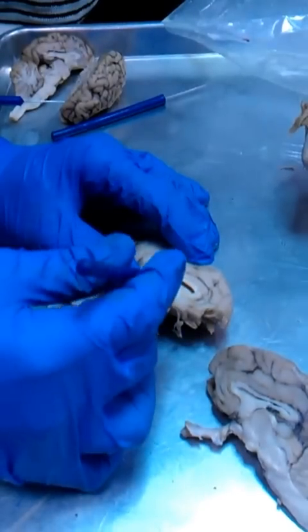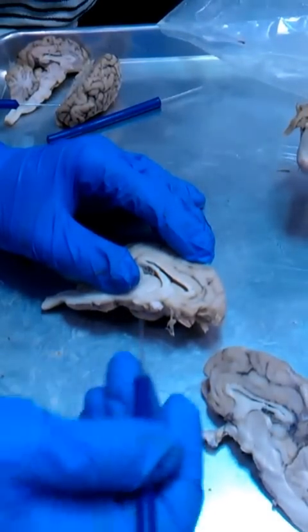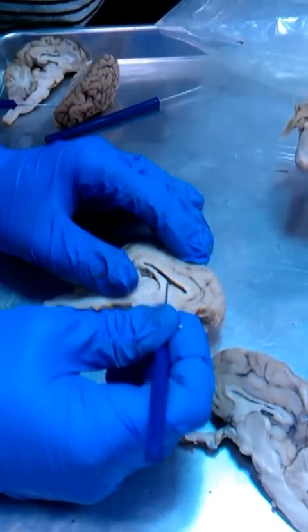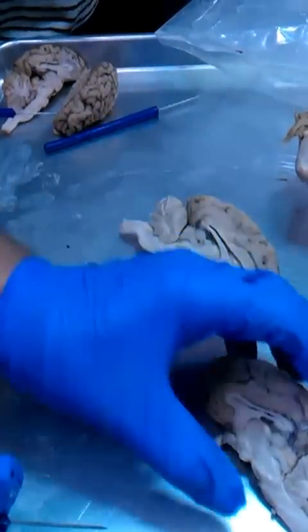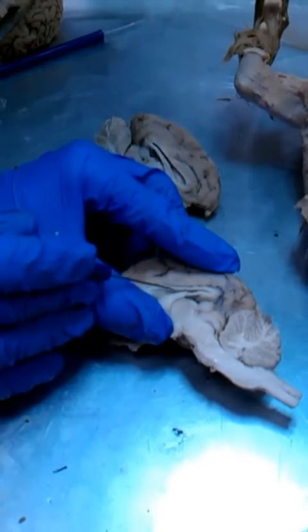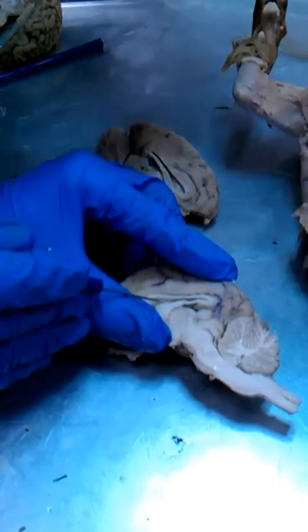Now in the same area as the lateral ventricle is the septum pellucidum. That is a membrane that would connect this to this. On this side it's not there because you can see right inside that hole. But if we look at the other side, the same area, you see how there's a membrane connecting these two things here and you can't see inside the hole. That membrane right there is the septum pellucidum.